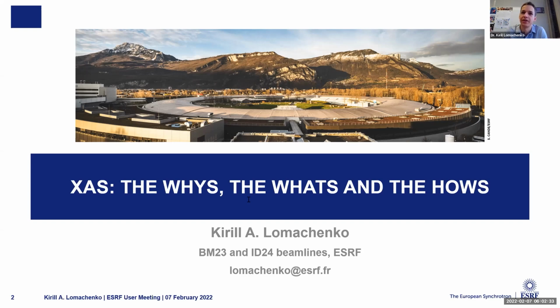Probably for XANES it can be even more dramatic, because in EXAFS it will be just an increase of the Debye-Waller factor, if it's not too drastic. But in XANES it can change the picture quite a lot by squeezing the high-intensity oscillations. So it's better not to measure in transmission with absorption higher than 2.5.